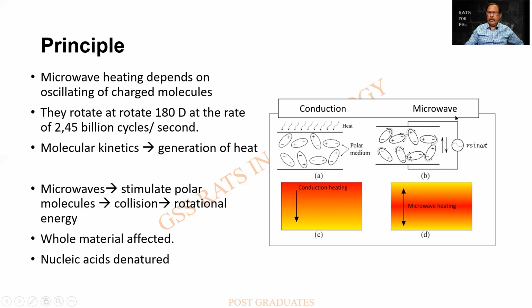The microwave, on the contrary, again there is an amount of energy that is created within, and it goes in either direction. Look at the arrows over here, whereas here it is coming from outside inside. You find again there is a dissipation, and the cathode attains immense charge of positive and negative, and the molecules are arranged in various patterns. This is the principle of the microwave. And the oscillation of these charged molecules is the basic principle of the microwave.